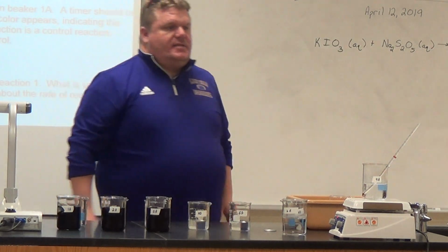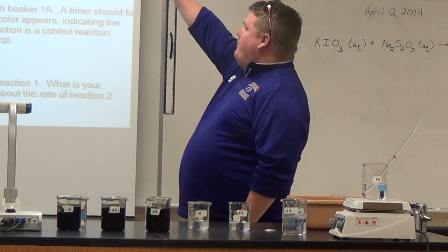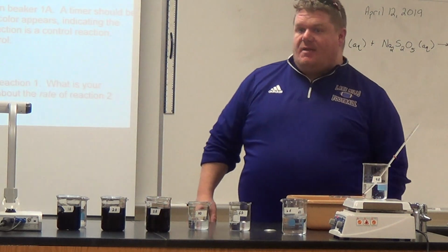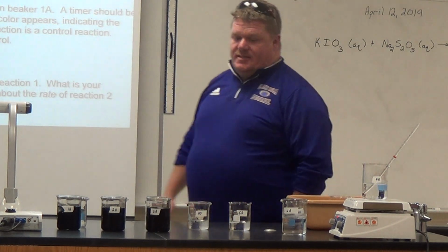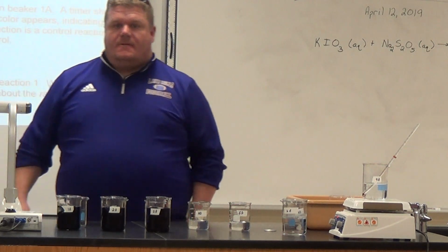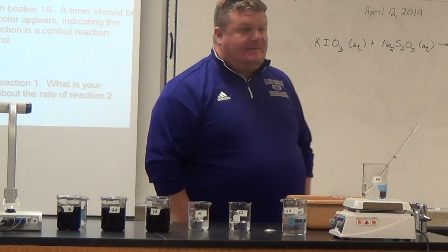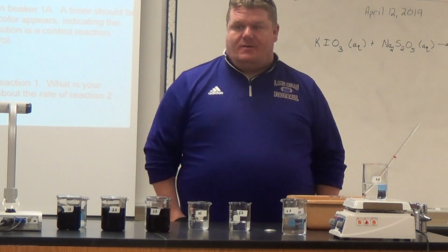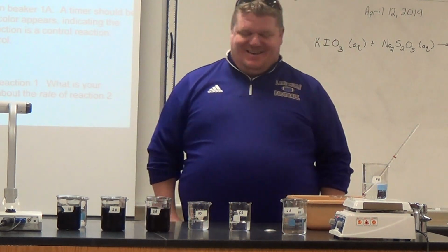Okay, make a prediction. Is this going to be faster or slower than beaker 1, reaction 1? And notice, for reaction 5, we're back to the same concentrations we started with, aren't we? Okay, we have the same concentrations in 5 as we had in 1. The only thing that's different now is the temperature. All right, someone like to make their prediction known? Chance. I say it's gonna be slower. Do we agree it will be slower? Yes. Elizabeth thinks it's going to be slower.